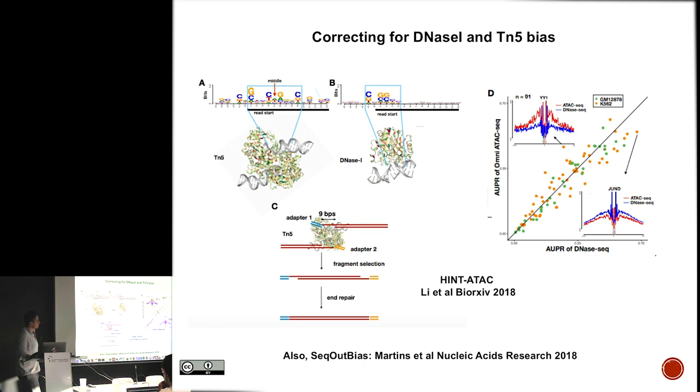So the effect is greater felt if you want to look at footprints of a particular factor between different conditions, or if you want to see if there's an additional structure that you're not observing. If you don't normalize, you lose those features, right? So if you have a transcription factor like PAX that's bound to a specific site and you want to know, in these sets of open chromatin regions, what does the PAX footprint look like? What about in these? What does it look like? Is there a difference? Could there be cofactors? If you don't normalize with the transposon bias, you can't resolve those differences.